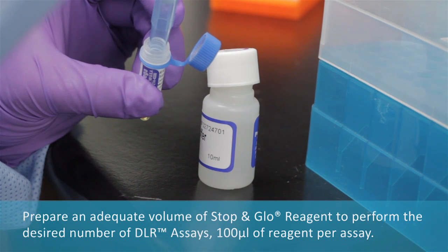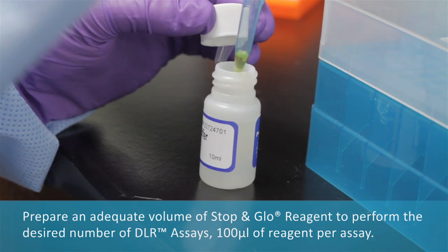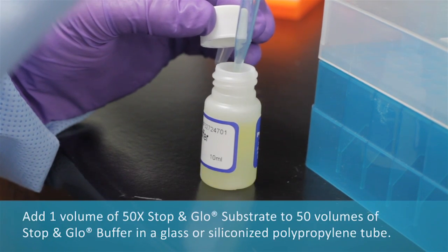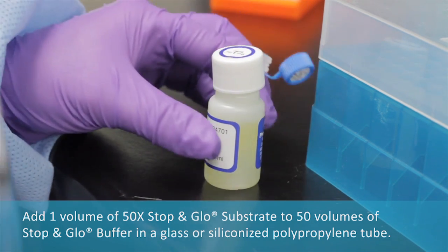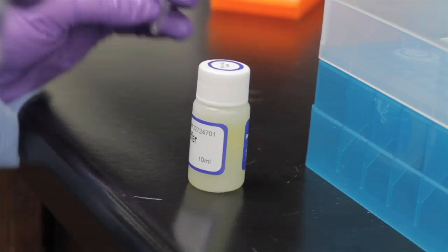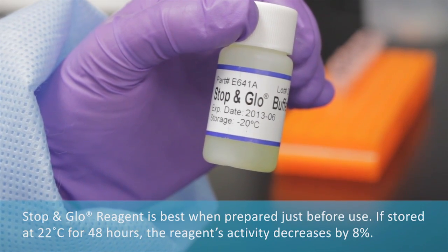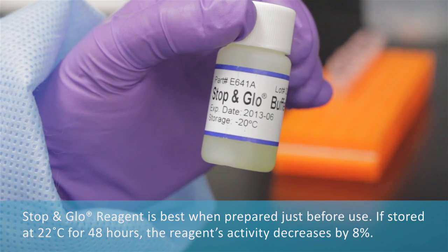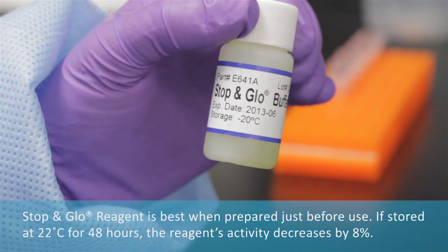Prepare an adequate volume of stop-and-glow reagent to perform the desired number of DLR assays, using 100 microliters of reagent per assay. Add one volume of 50X stop-and-glow substrate to 50 volumes of stop-and-glow buffer in a glass or siliconized polypropylene tube. Stop-and-glow reagent is best when prepared just before use. If stored at 22 degrees Celsius for 48 hours, the reagent's activity decreases by 8%.